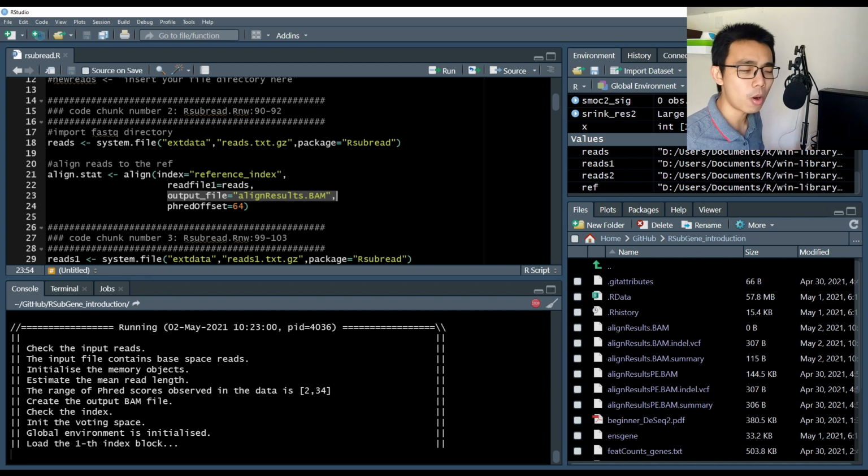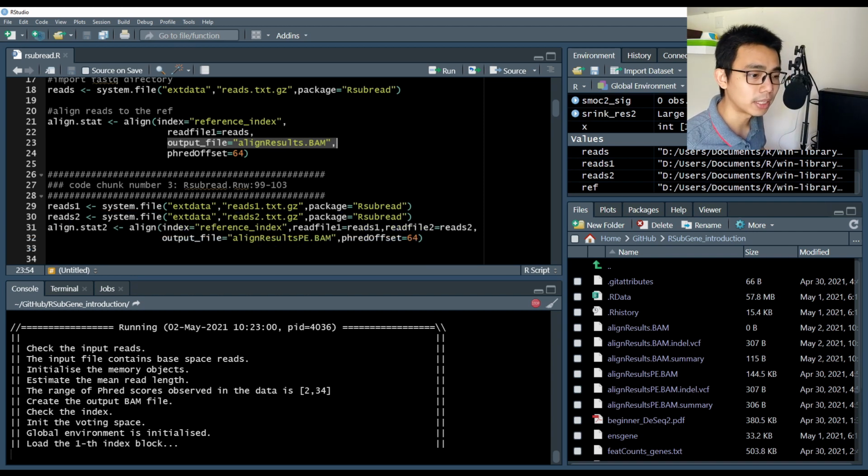If you want to know more about the BAM file and SAM file, you actually did a video about that, which I can link somewhere, hopefully. Okay, it's still going to take a while.